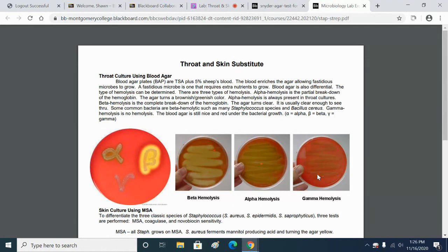Any other questions about blood agar? Did any students ever have strep throat in class? Well, we can't tell, right? Because all we know is that if it's a small white colony that's beta hemolytic, it most likely is some type of streptococcus. And when you do a gram stain, you do see beautiful long chains of cocci. But whether it's Strep pyogenes or just Strep mutans, we can't tell. So there's no way to know for sure. Oh, okay.